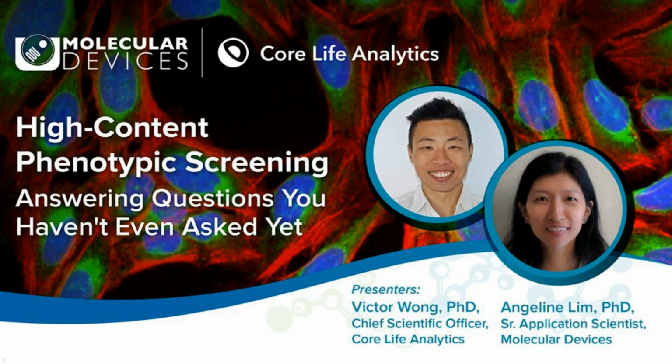Yes, you can use additional dyes. At least the imager that we have has eight channels, so you have room to add on more dyes. But do take note of potential bleed through or spectral overlap in this case. So make sure you optimize your antibody or your dye staining. You can also, instead of adding more dyes, swap out dyes. So the cell painting protocol is very adaptable to your specific needs.